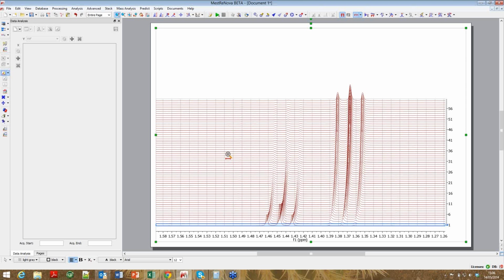so we need to look at ways in which we can deal with it. We spoke about, and I showed you, one particular way, which is to draw an integral region that you can move around. We have the wonderful little green snake that you can thread your integrals through, and I'll show you a few more of those today. But I also want to talk about alignment, because that can sometimes get you around the whole problem. If you have a whole data set like this one, where all the peaks are moving at the same rate, then you can consider doing an alignment process to help you.